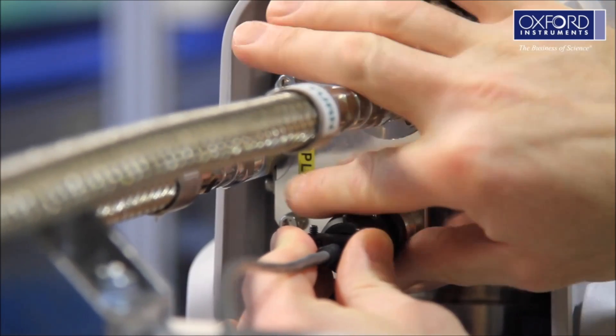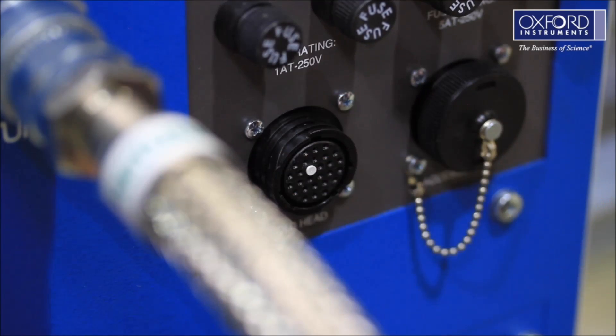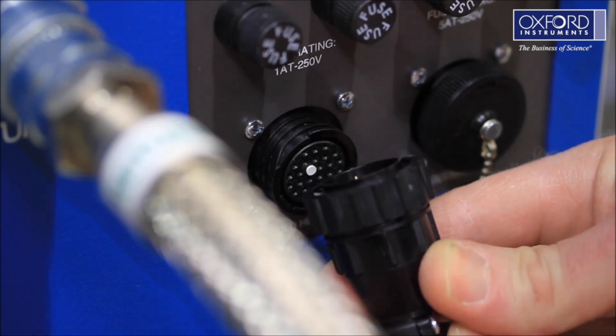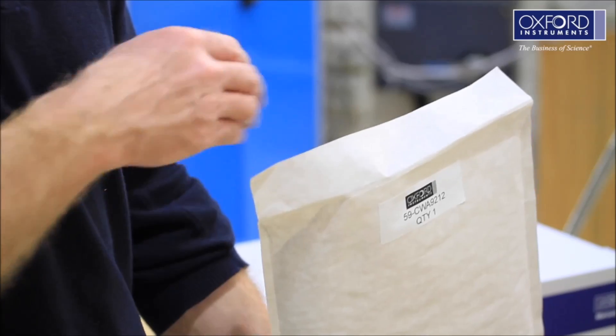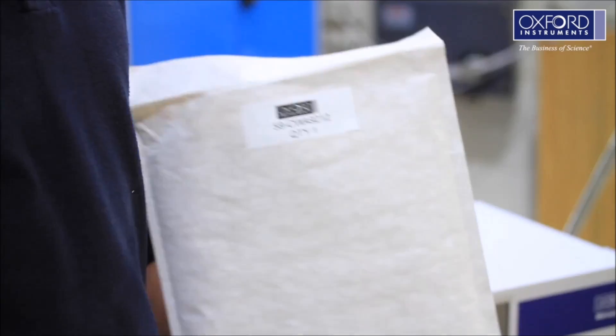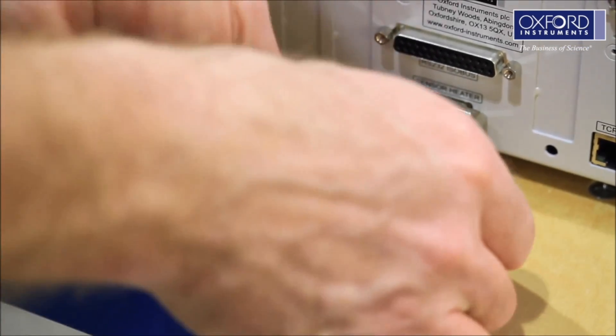Connect the cold head power cable to the cold head and to the compressor. Connect the cryostat cable to the back of the mercury ITC, making sure to do up the retaining bolts.